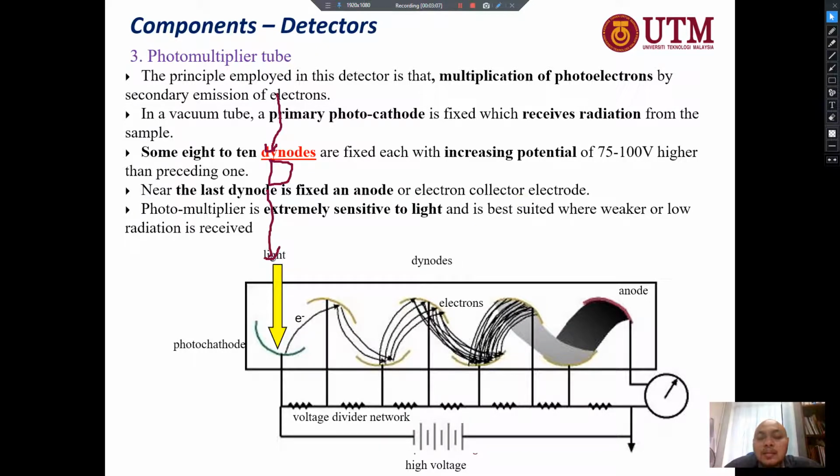Let's say you have a situation where you have received a sample that you believe is in trace amounts. For example, you encountered a bombing case, and then you need to find the explosive compound. Of course, after the explosion, the amount of explosive compound left will be very little. So you need a very sensitive detector, which I could suggest is the photomultiplier tube. So that is the kind of problem that you need to solve.